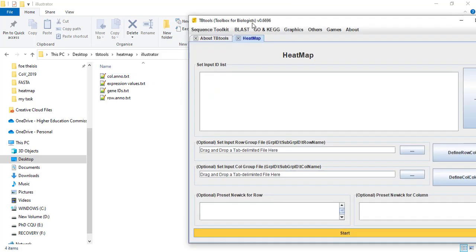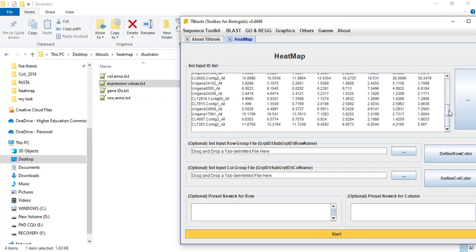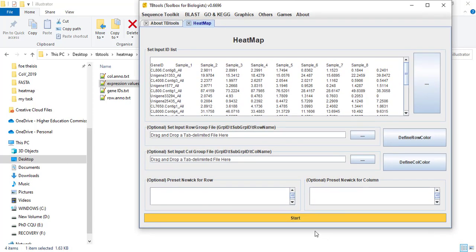Here I have some genes with their expression values in tab-delimited format. The first column shows the gene ID and the remaining columns are the expression values of these genes. I have 8 samples, so I have 8 columns plus a 9th column for the gene ID. Now click Start.